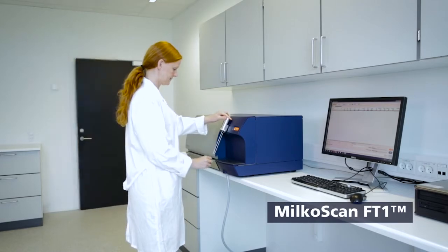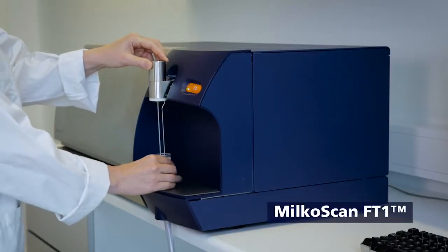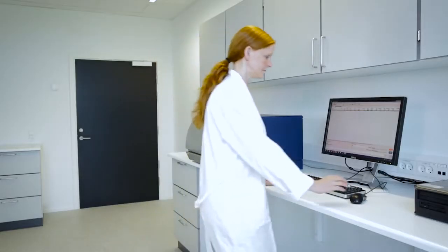Ensuring the safety of milk deliveries, staying competitive and producing consistent quality products are major concerns in today's dairy industry.